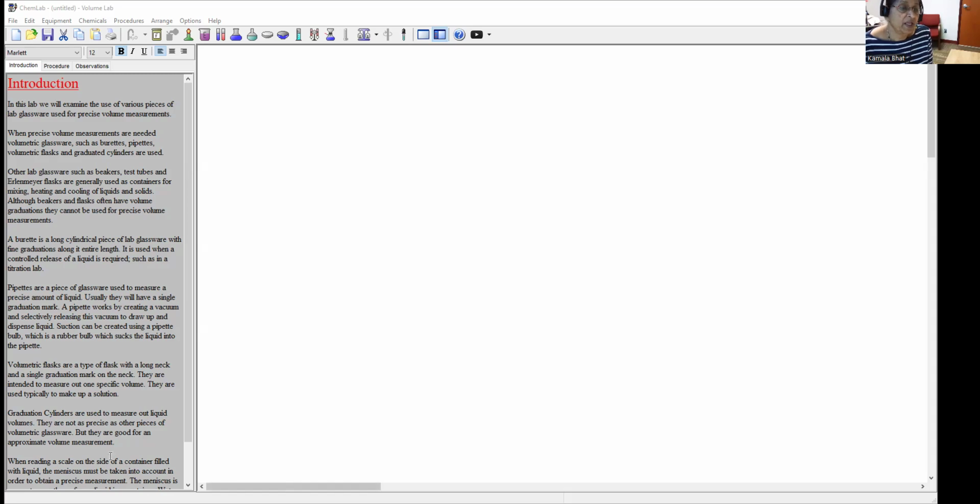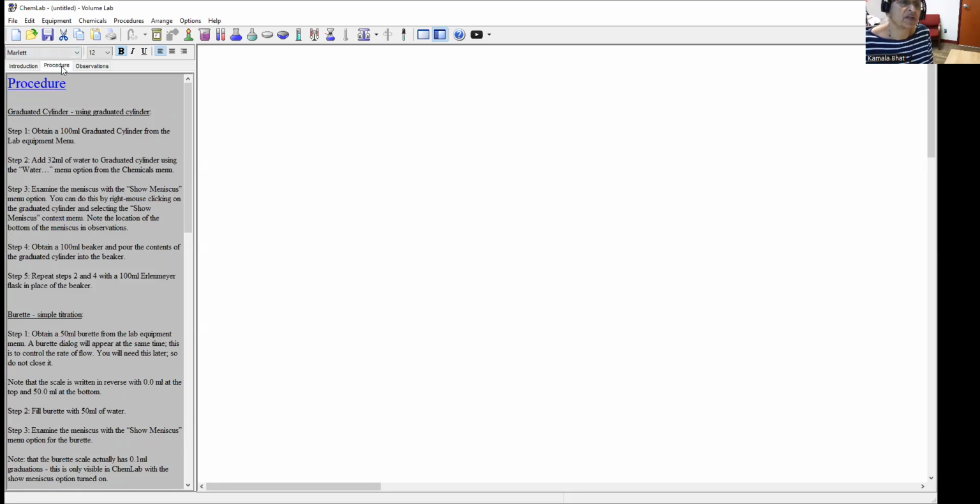So with that, go through this introduction and write the introduction by yourself. I'm just going to demonstrate a few techniques. Again, these techniques must be learned in order to be accurate in your data. Don't just jump into the experiment and start doing it without practicing them.